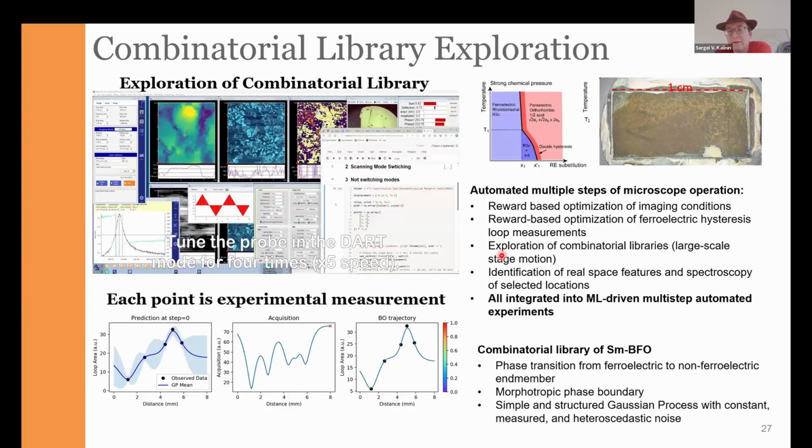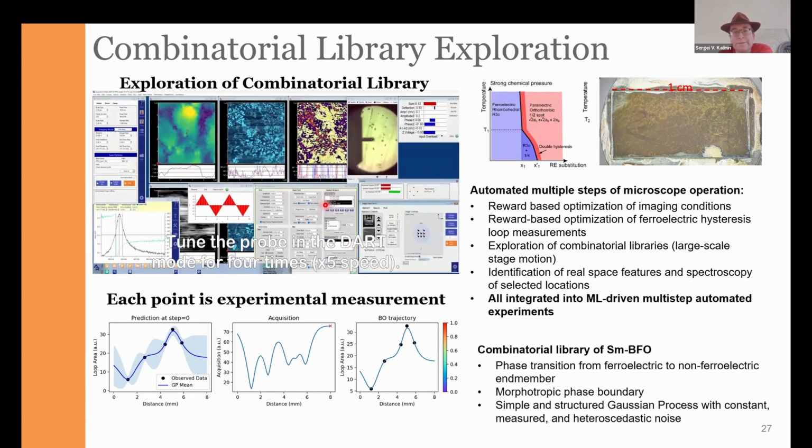So obviously, with the roughness experiments, we learned something about the material growth, but it's far more interesting to run these experiments when we explore the functional properties of material. And here, the interesting thing is that scanning probe microscopy is actually an ideal tool to, so we cannot probe the mechanical properties with SPM very well, at least not for hard materials.